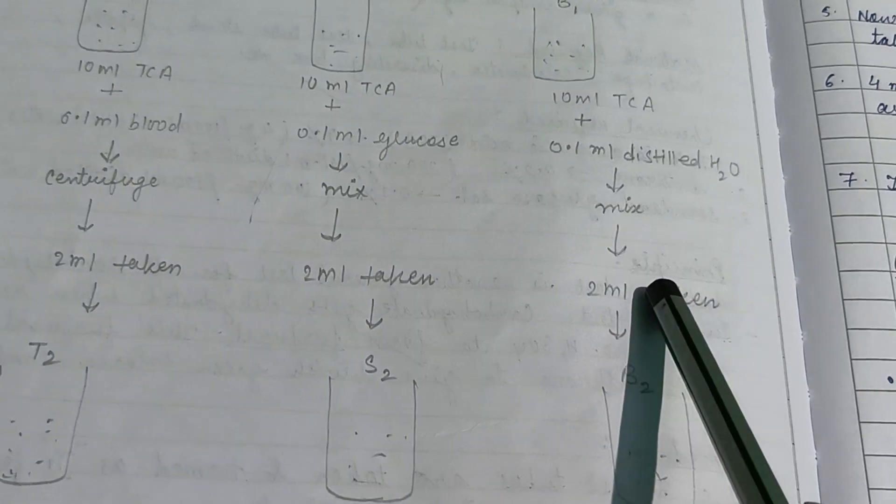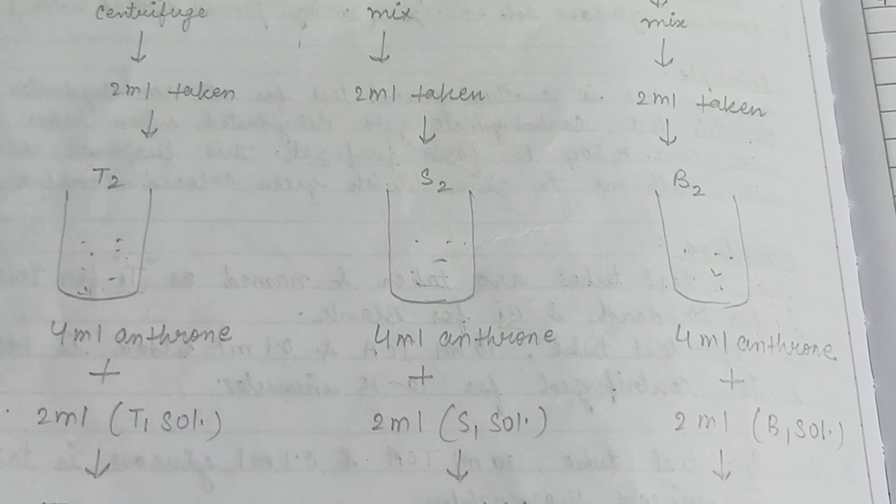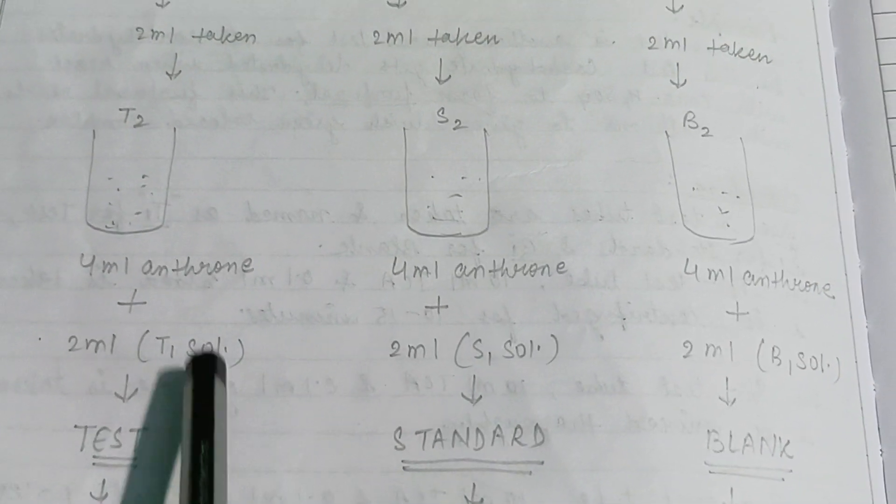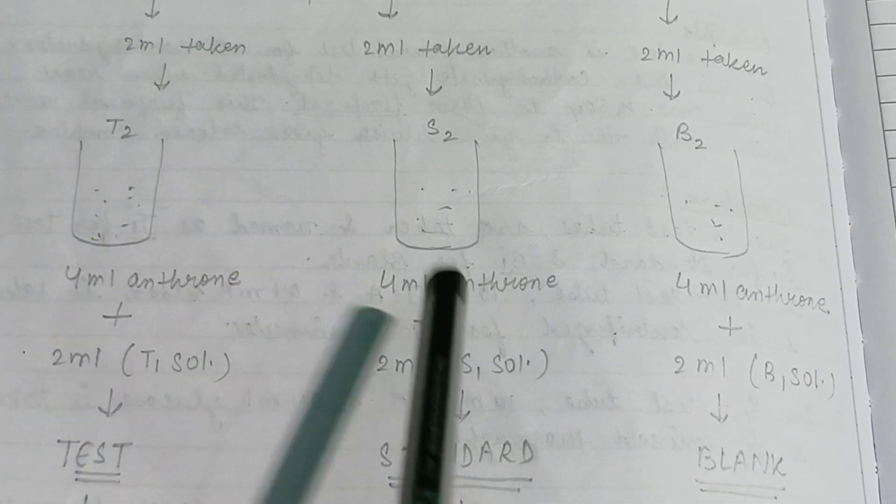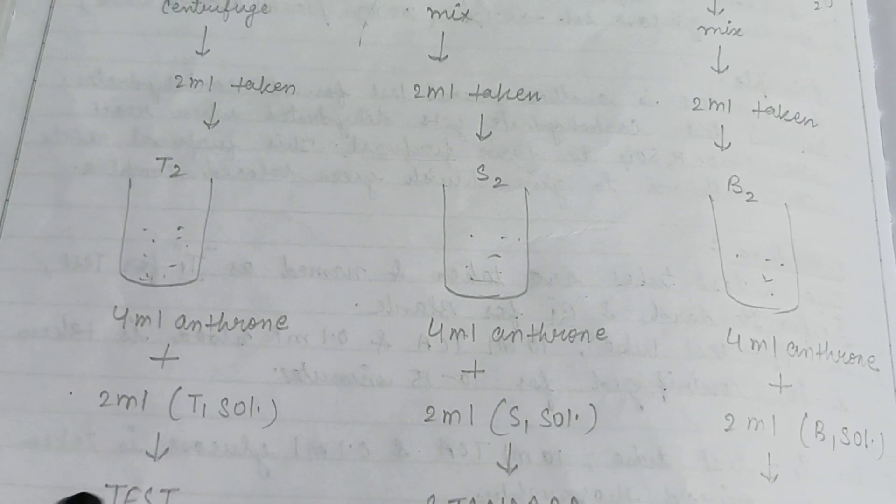2 ml from B1 is taken in the B2 test tube. Then 4 ml anthrone is added in each tube T2, S2, and B2, and the solution is mixed. The reading of the colorimeter is estimated.